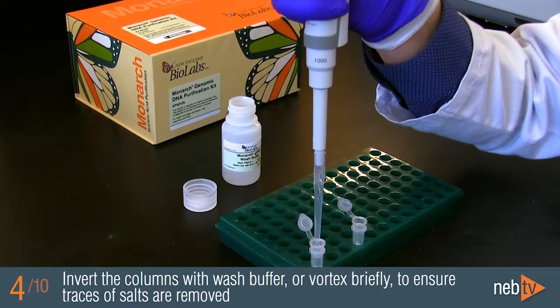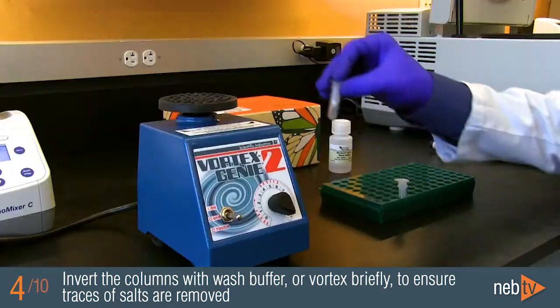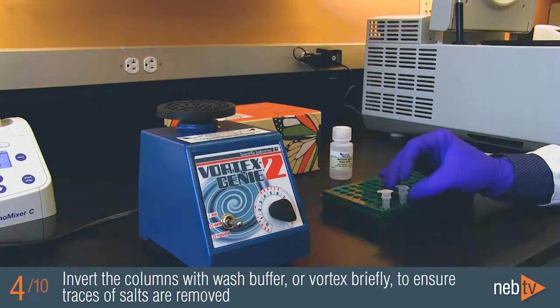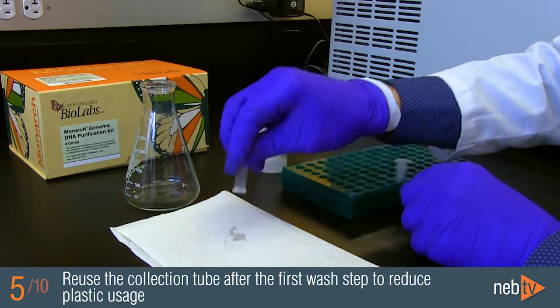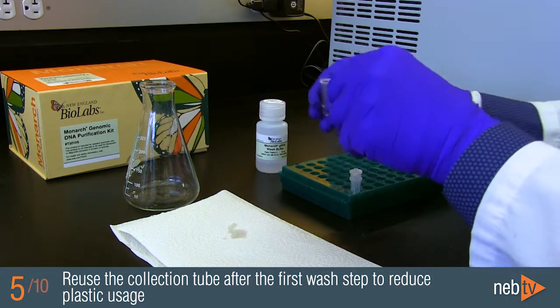After adding the wash buffer to your samples, invert the column a few times or vortex briefly. This will aggressively wash away any remaining buffer salts that may have contacted the upper column area. After the first wash spin, empty the collection tube and briefly tap it upside down on a paper towel in order to reuse it in the next wash. This reduces the total amount of plastic used in the prep.